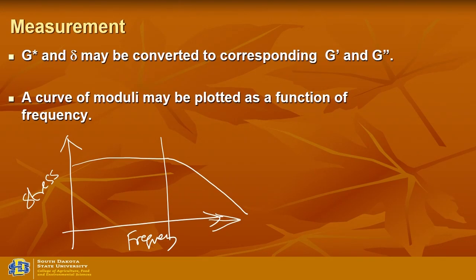So this would be the maximum stress you can employ for further amplitude or frequency tests, so that you can see the storage and loss modulus values, or elastic and viscous modulus values.